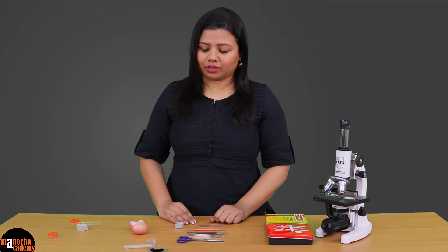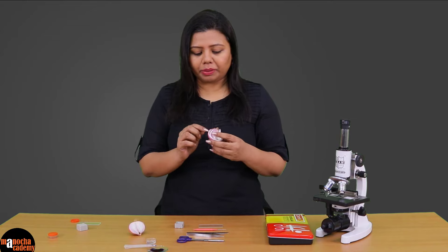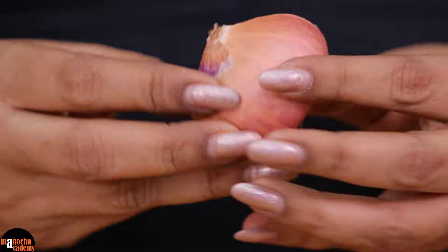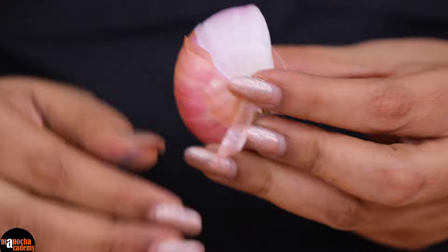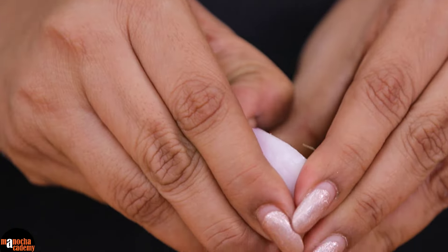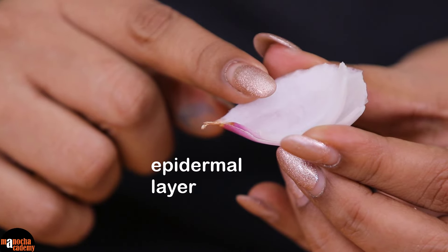Now let us start with the work. First of all I have taken an onion and cut it into halves, and then I will have to peel out one of the fleshy leaves of the onion. I will take out the leaves in such a manner that I get rid of the dry scaly leaf which is present outside and only have the fleshy part. After this we are going to need the inner lining of this fleshy leaf, which is actually an epidermal layer.